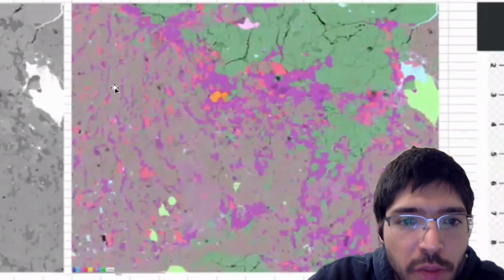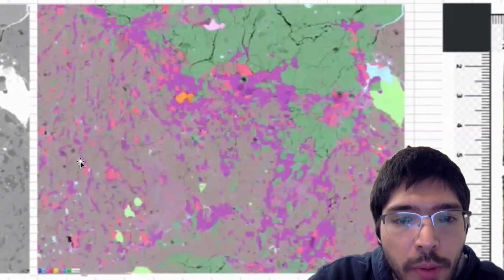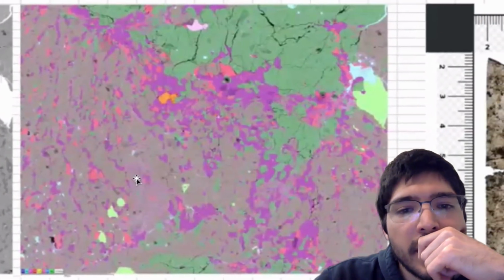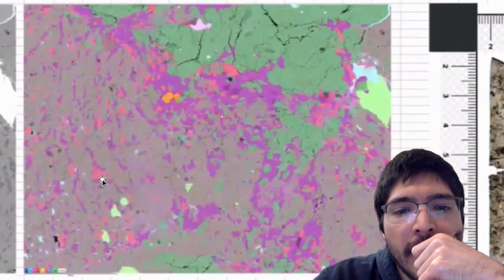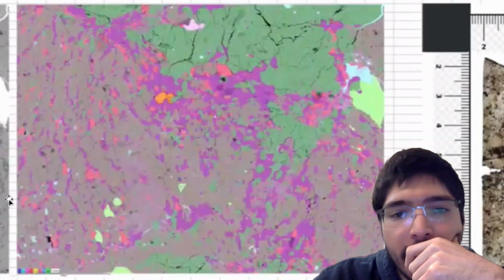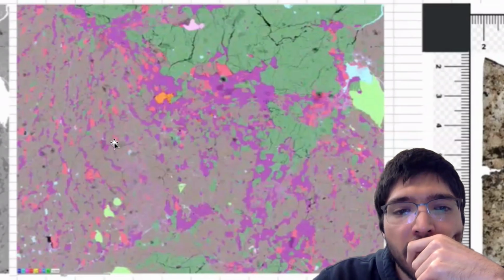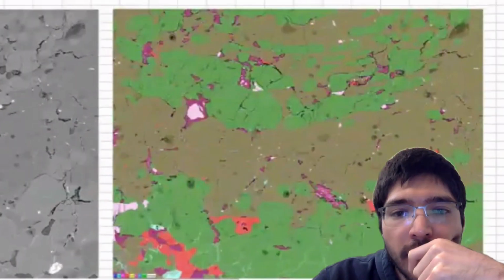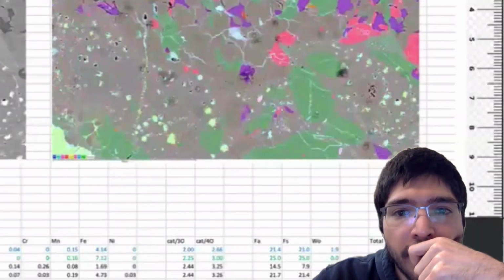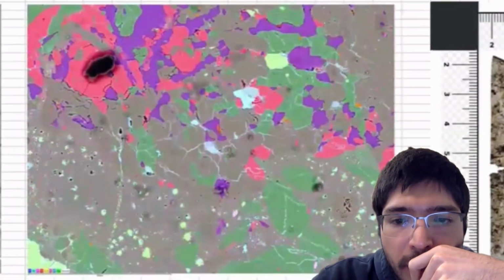The feldspar, though, which is interesting, you'll see that the grain size varies quite a bit from one part to another. And in this case, it makes distinguishing between a type 5 and type 6 chondrite a little tricky. So I tend to look at the average grain size of the feldspar across all the sites. If we go back, we can't really see it very well in site 5, but in site 4, we can see it's still relatively coarse, although maybe here it's a little different.